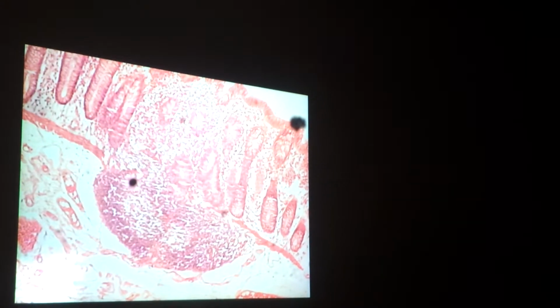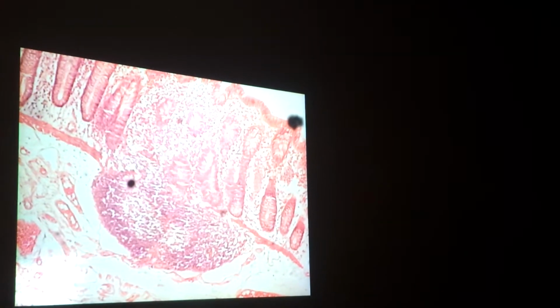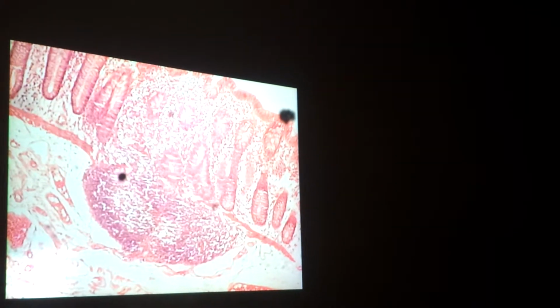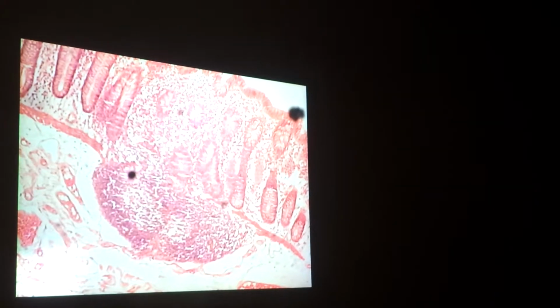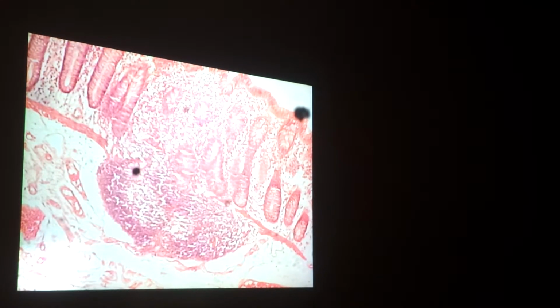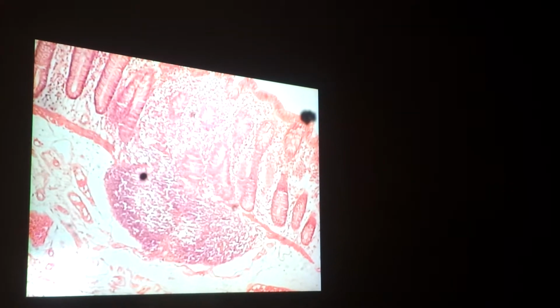If this would come on a lower power, it would be marvelous. And it is. Success. All right, look. Now look, everybody, see the lower power? The lower power shows everything pretty good. For example, this right here, the whole thing is a lymph nodule. That's a test question. The whole thing is a lymph nodule. This line right here is muscularis mucosa. That is a test question.